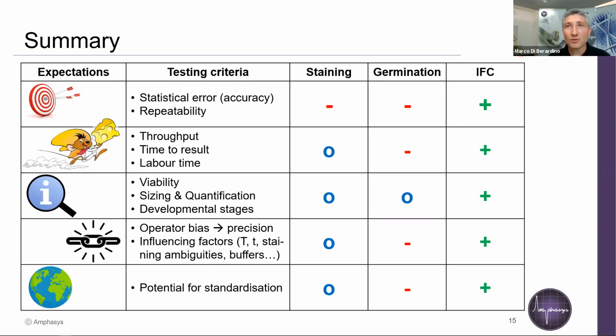I mean, it was shown on one of my slides as well. Vigor is sometimes measured by measuring how fast the pollen tube grows in the germination media. But if you have a good or bad germination media, you have different speeds there as well. So is the vigor different if you choose a different germination media?